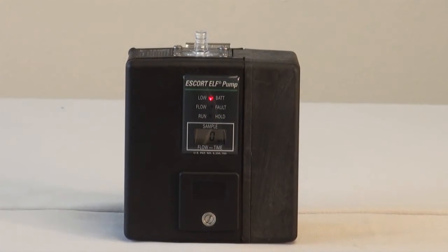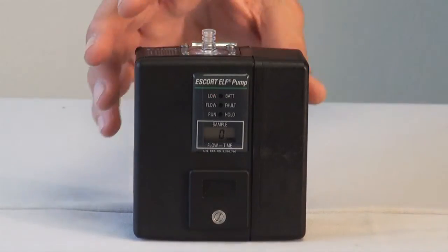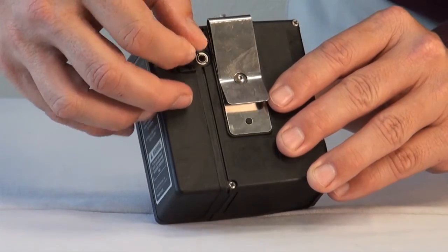When the battery voltage drops below 4.1 volts, the pump will shut down and the low battery LED light will be on. At this time, the battery needs to be recharged. You can recharge the battery while it is attached to the pump, or by itself.